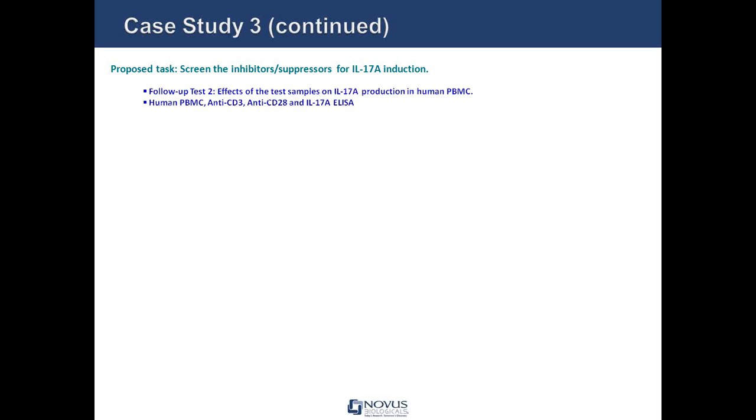We just wanted to check whether these 3 compounds really inhibit IL-17A production. So we checked the IL-17A production by ELISA.